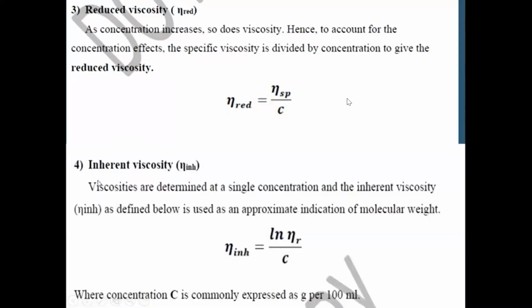Number 4, inherent viscosity. You know, viscosities are determined at a single concentration, and inherent viscosity as defined below is used as an approximate indication of molecular weight.